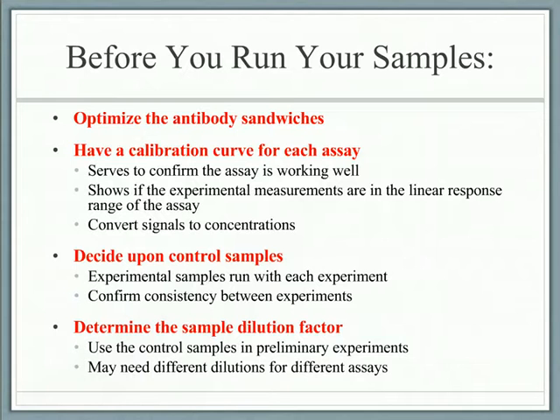So the dilution factor is the factor by which each sample is diluted into a sample buffer. And that can either be small or large, so maybe just a 2-fold dilution or less, or it could be a 10,000-fold dilution. And it depends upon the starting concentration of your analyte. If you have a wide range in starting concentrations in your multiplexed assay, you may need to split up your assays into those that are highly concentrated and those that are not concentrated, so that you can match the dilution factor within those assays.